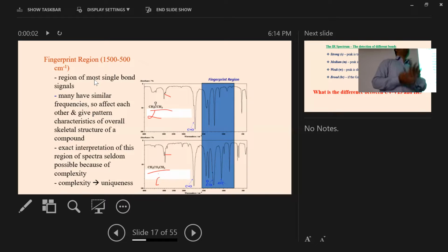However, due to different types of problems in our instrument, we can have some noise, or some limitations, or some signal which is not expected or which is not coming from the sample. However, if the molecule has certain absorbance, then we can easily find out that we should not consider this a noise. Definitely the signal intensity is quite low, however, not flat like this one. Therefore, we can easily consider this is the signal coming from something, some modes of vibration.